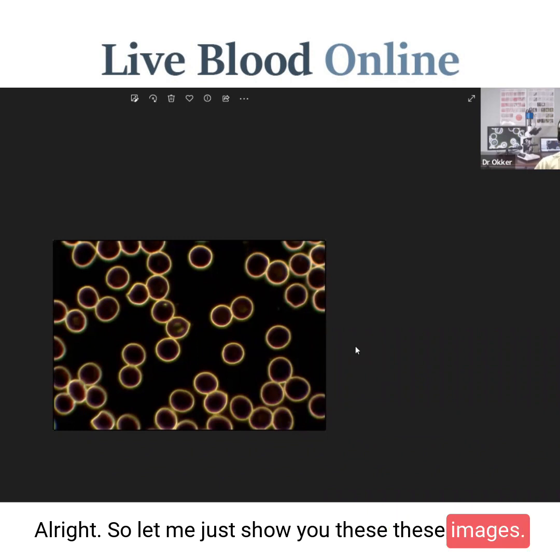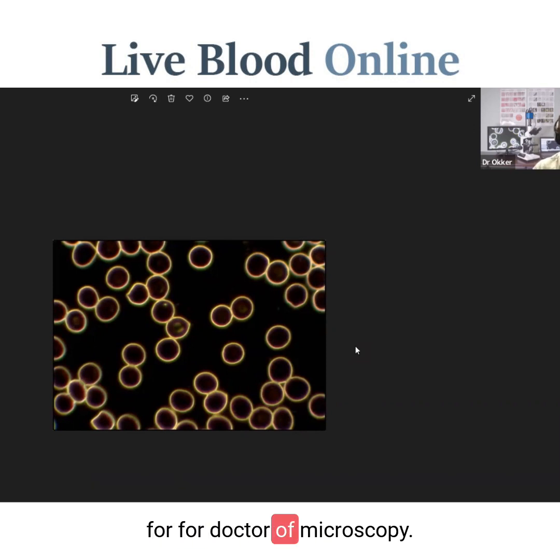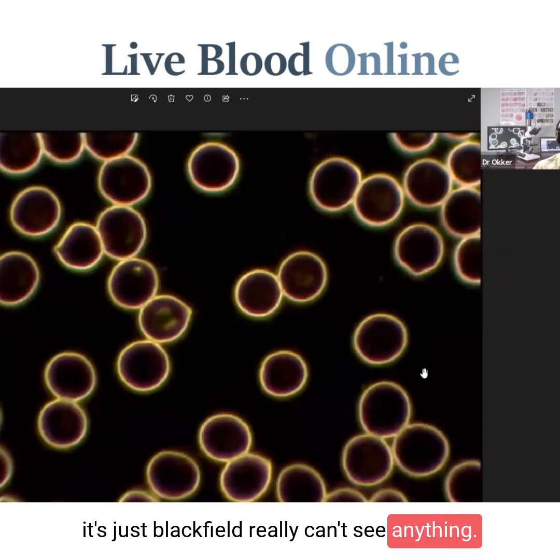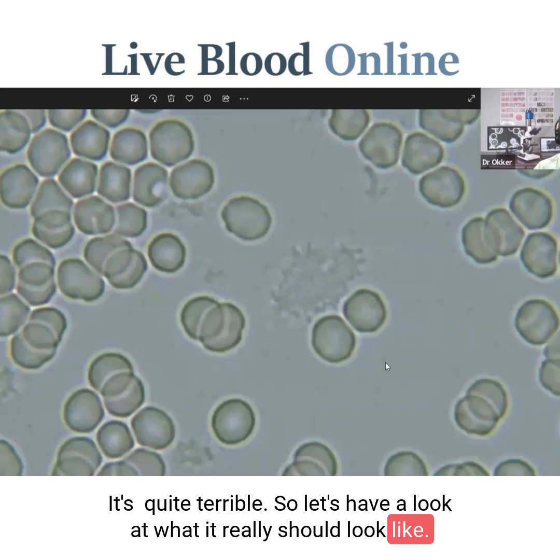This image is from another microscope often recommended for dark field microscopy. Again, in the plasma it's just black — we really can't see anything. It's quite terrible. So let's have a look at what it really should look like.